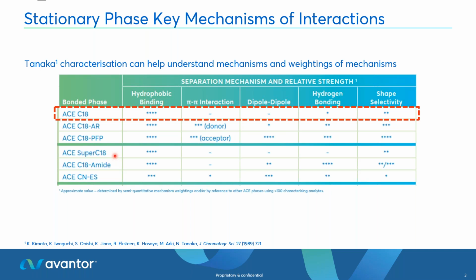So that could be another kind of dimension when you're doing your method development, if you've only got that 2-column switcher to play with pH, because again, we've seen massive differences in selectivity when you're analysing ionizable compounds, of course, by changing the pH between sort of high and intermediate or high and low pH.